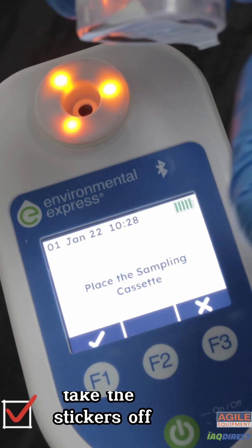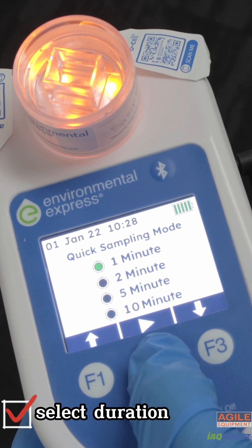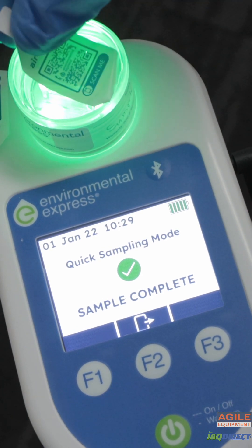Note down the cassette serial. Take the stickers off the cassette and place it onto the pump. Select the duration of the sample. Remove the cassette and place the stickers back on each side of the cassette.